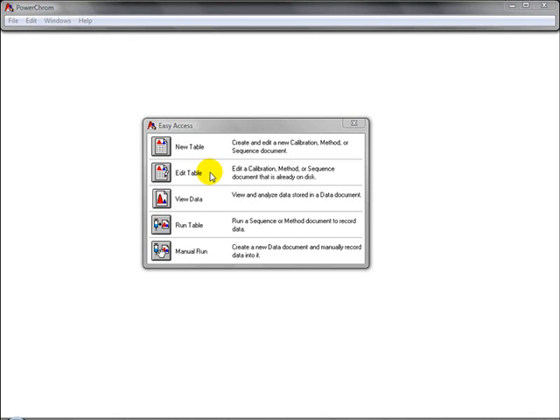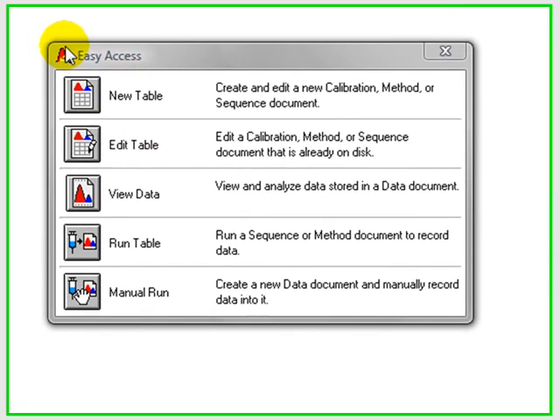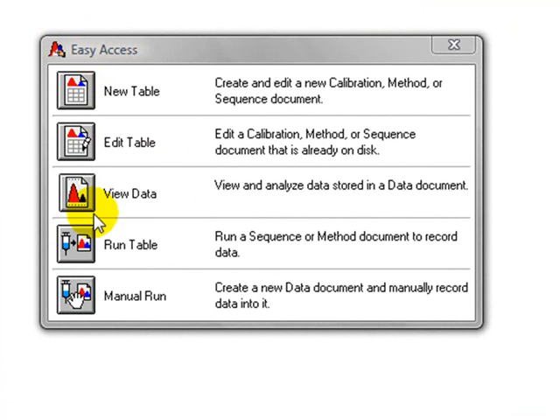This screencast video shows you how to do a C4D analysis in the PowerChrome software. When you open the PowerChrome software, you get the Easy Access window.